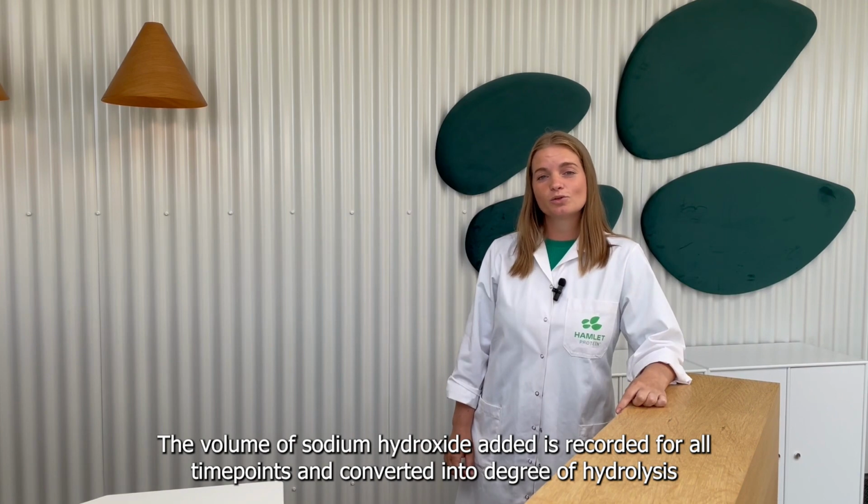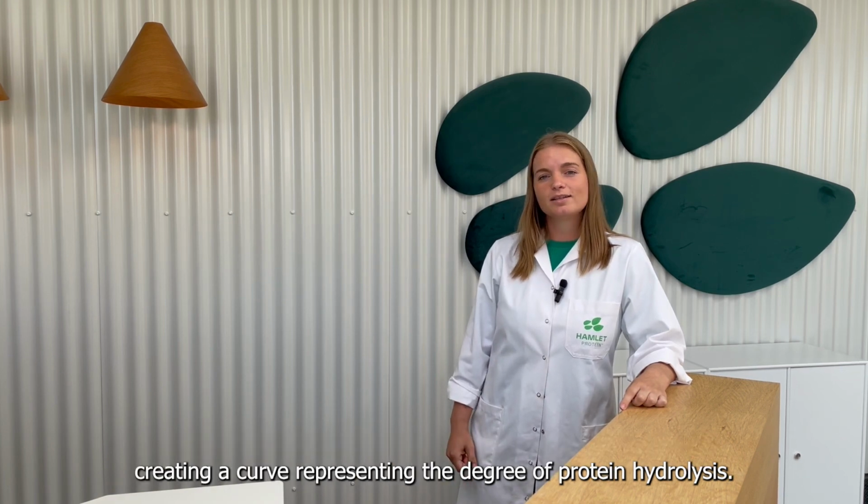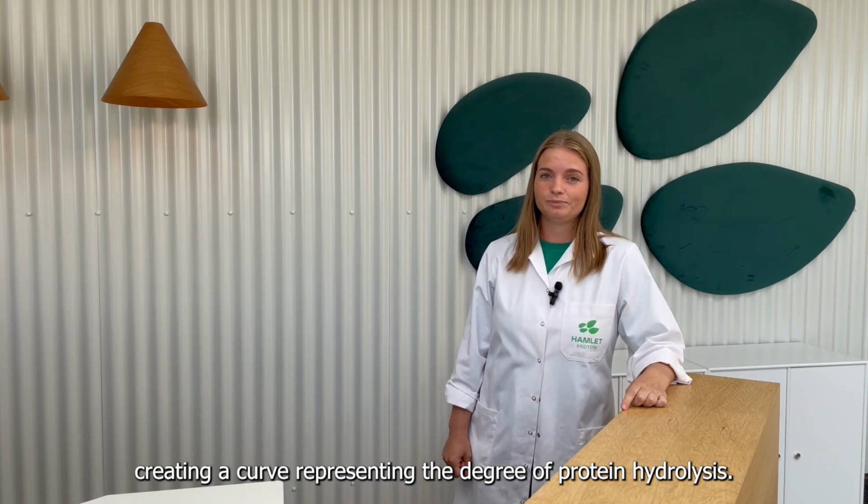The volume of sodium hydroxide added is being recorded at all time points, and this volume is being converted into degree of hydrolysis, and it gives you a curve representing the progress of protein hydrolysis.